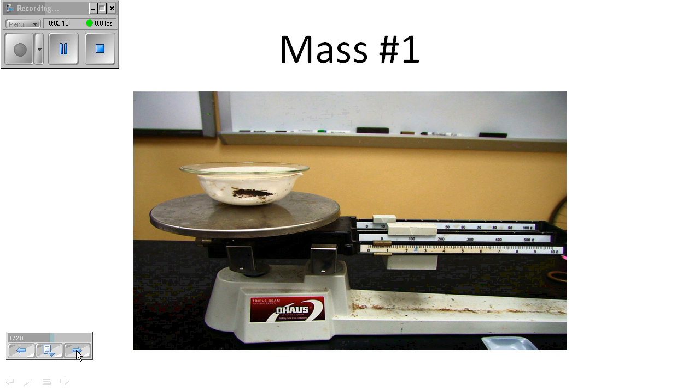Okay, once you have cleaned and dried your evaporating dish and watch glass, you're going to put it on your balance, and you're going to determine the mass of the watch glass and cover. It tells you to do that in the procedure, and you should record that in your data table. You need to be very careful when doing this lab that you are following the procedure as written and not just trying to fill in the quantities required in the data table.